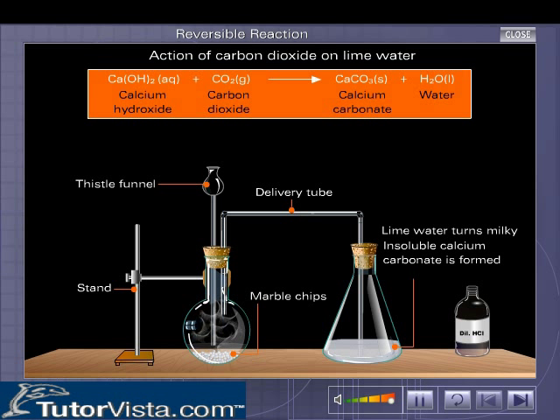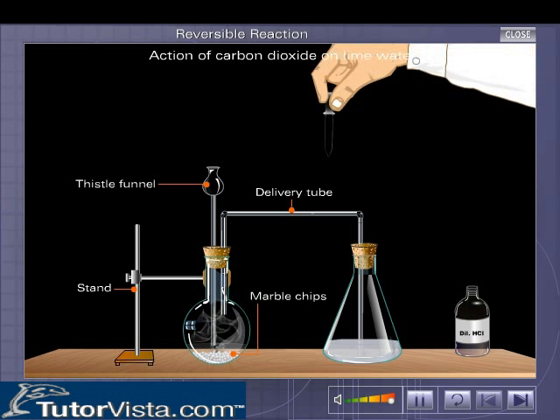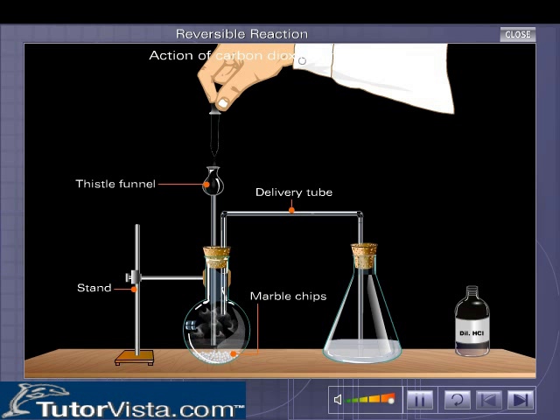Continue the addition of dilute hydrochloric acid into the round bottom flask. Now observe what happens in the conical flask.